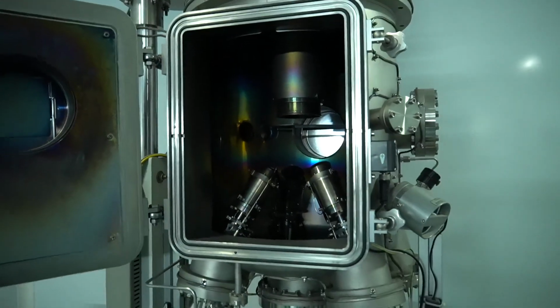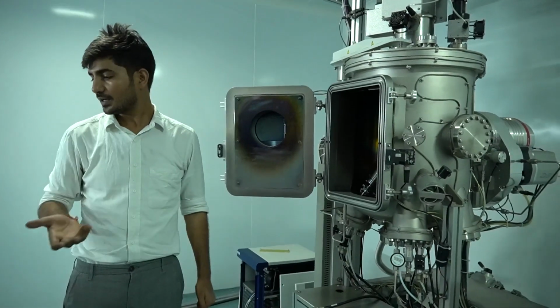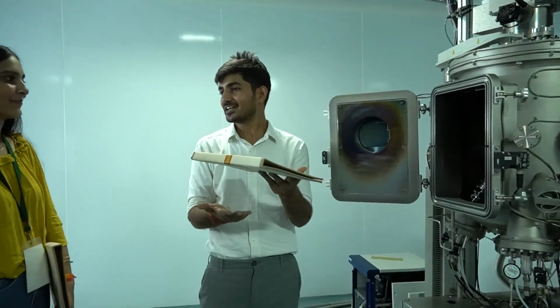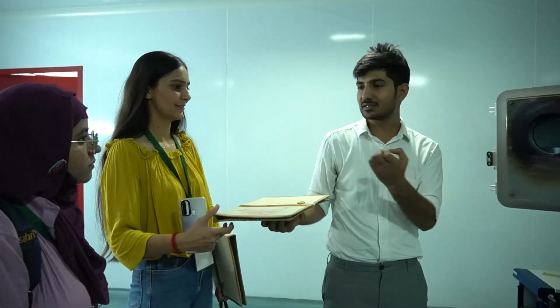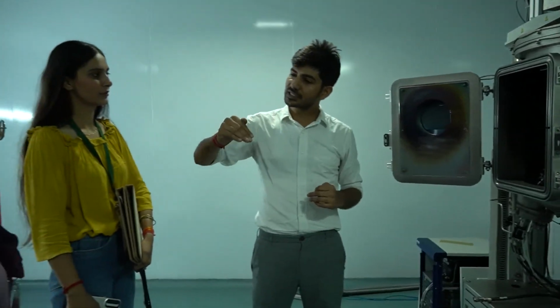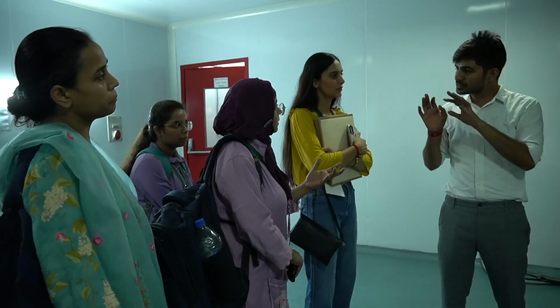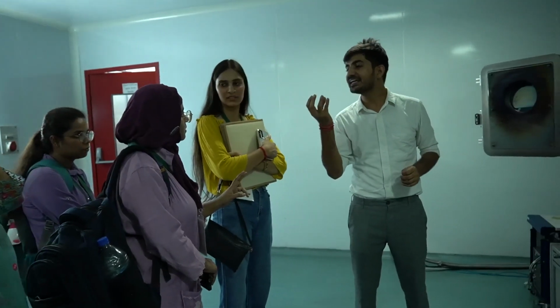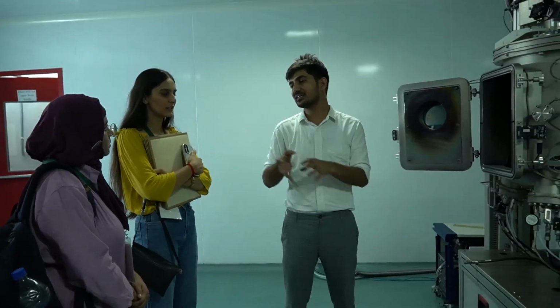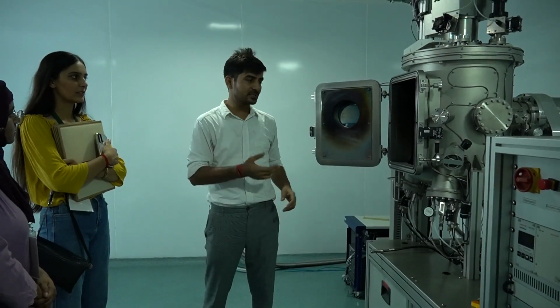Okay. तो यहाँ पे हम सबस्ट्रेट रखते हैं। सबस्ट्रेट मतलब जिसपे आपको कोई भी फिल्म बनानी है। अब जैसे ये फाइल है, अब इसको हवा में तो नहीं रख सकते, you have to put it somewhere ना। तो ऐसे ही you have to take some kind of substrate, उसके ऊपर you have to deposit some films। वो टारगेट कहते हैं उसको। टारगेट एक मटेरियल होता है, उससे आपकी फिल्म बनती है। प्लाज्मा बस एक रोल प्ले करता है, जैसे खाना बनाने के लिए you need heat, right? ज़रूरी नहीं है वो आपको एलपीजी से मिल रही है, सीएनजी से मिल रही है, या फिर उपले से मिल रही है, whatever source you are using you can use. Plasma is just playing a critical role in film, you know, film synthesis.